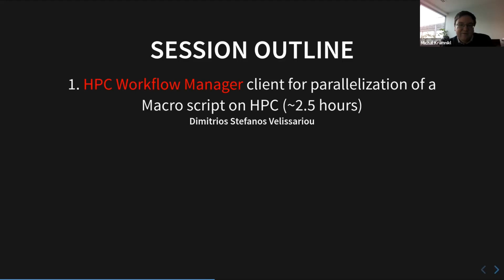So let's have a look at the session outline. I told you that there will be basically, let's say, 2 sessions interrupted with some intro and more in-depth look. So if we start with the first one, which will take approximately 2.5 hours, and don't worry, we will make a break, so it will not be a 4-hour run.